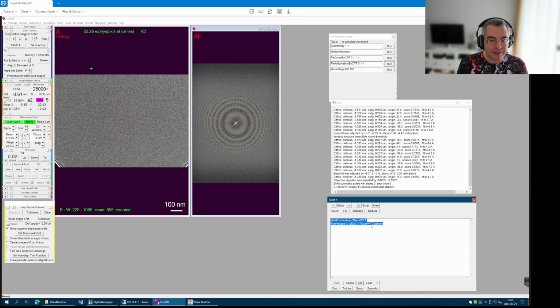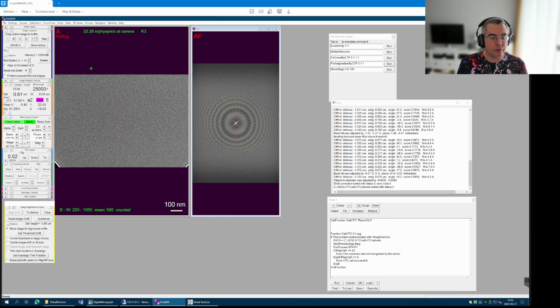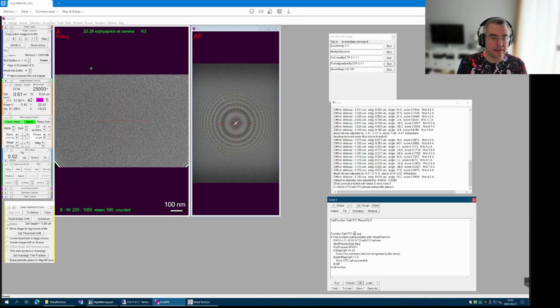It just does the work in the background. So I recommend people use this approach. And what I did here is basically I framed it into a function that takes a text argument, sets this argument as the next process argument, then runs the process, and then it also checks the returned code.